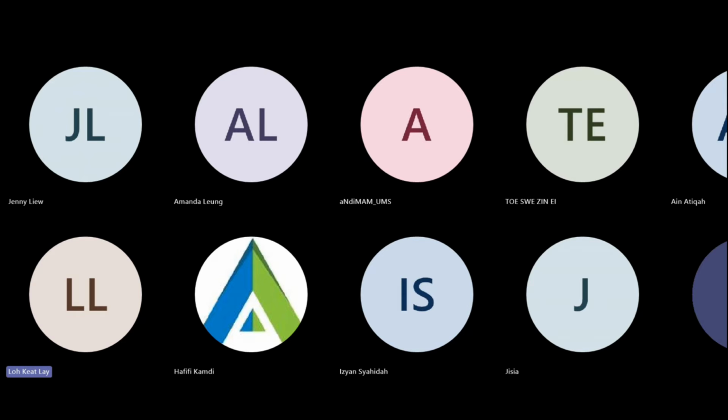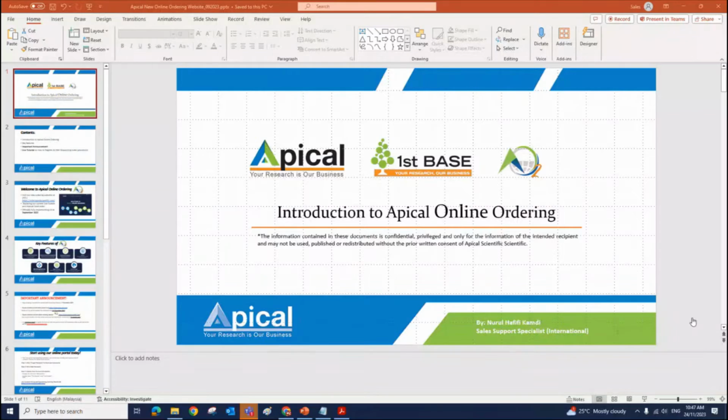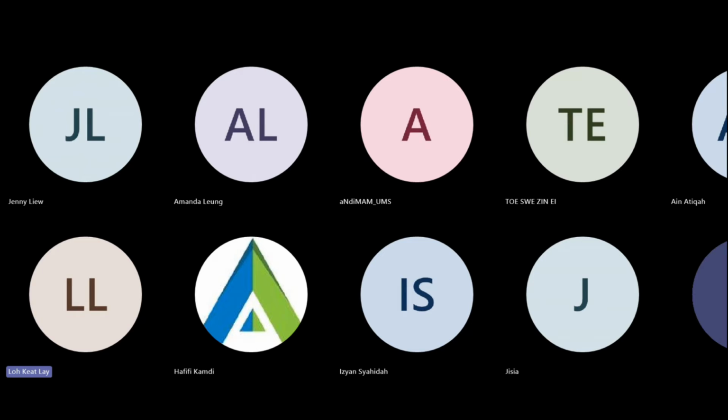We have some questions here, so maybe I can answer the question first. The question is about recommending to use the sequencing primer as the amplification primer, for example the 27F and 1492R primers, which are slightly different from the original paper.